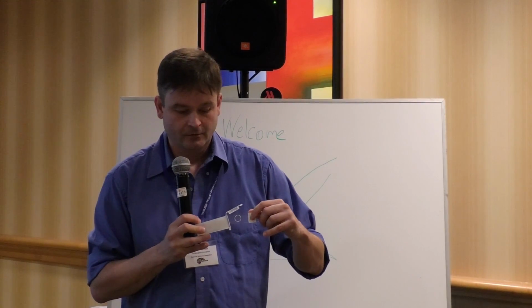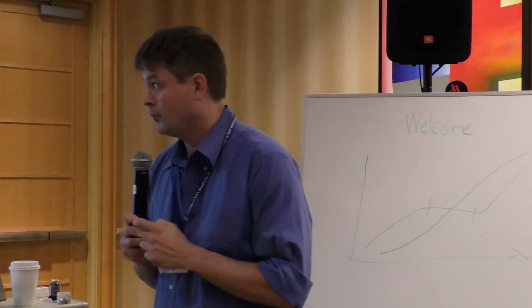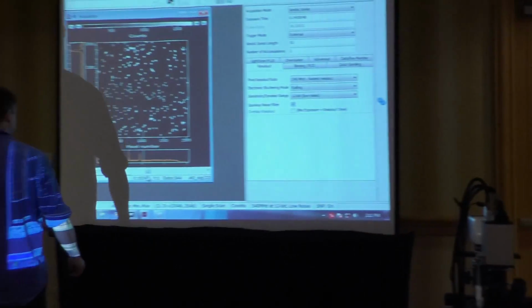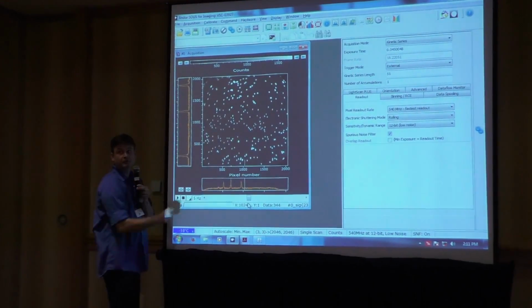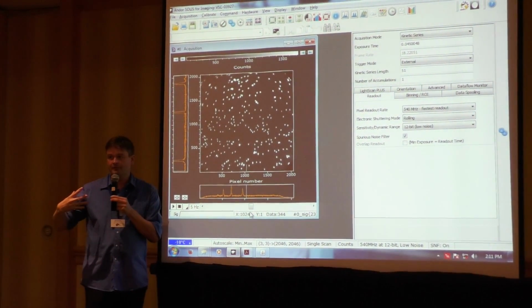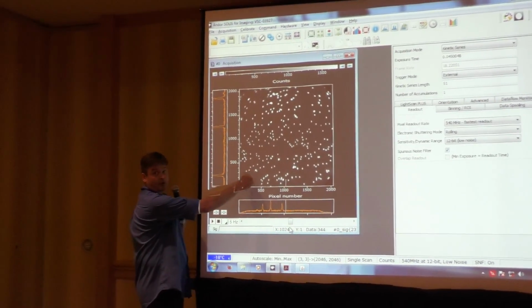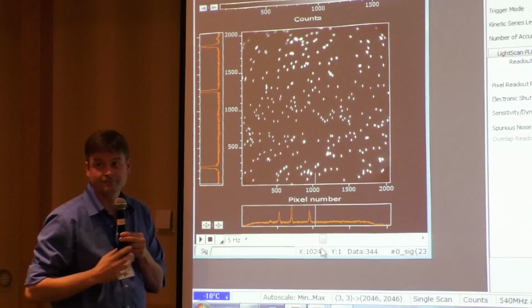But what these data just told you in the report is, well, be careful. Ask yourself, do I see more overlap of signals out here? Because if I calculate my overlap by pixels that overlap, then, well, the signal's bigger out here than it is in there. So there's a bias here.